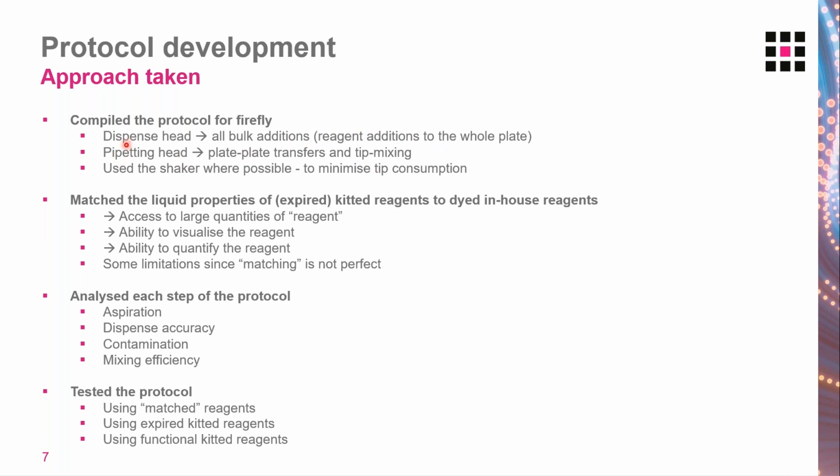We use the pipetting head, the air displacement 384 head, to do all plate transfers, any tip mixing, and also any transfers to a waste plate. When we're writing protocols, we try to use the shaker wherever possible to minimize tip consumption. So the shaker is on deck, and we want to minimize the tips that we use in the protocols.